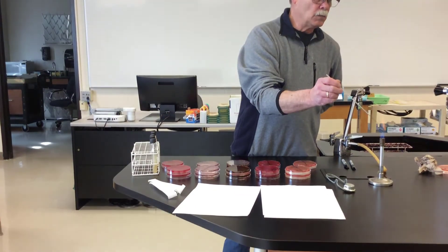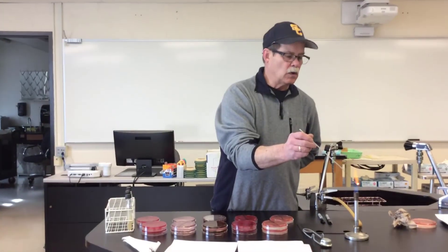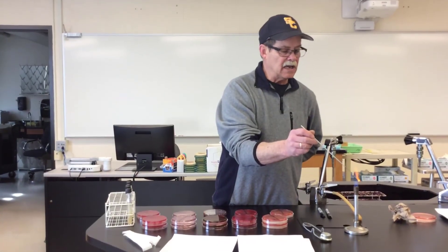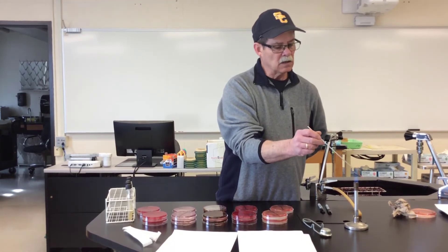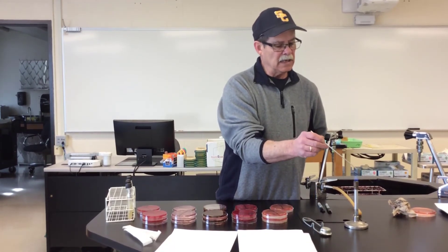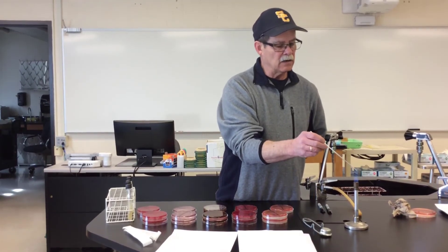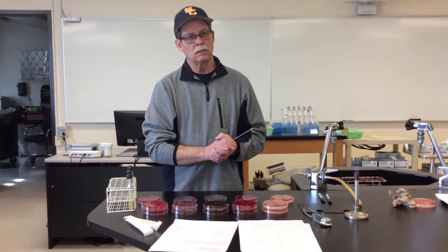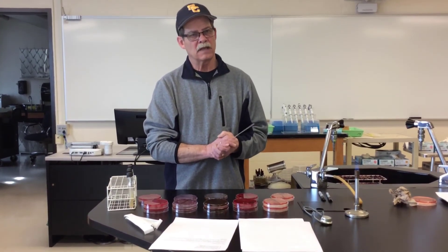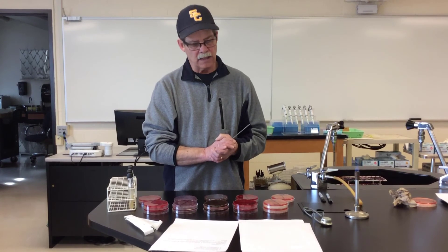Flame our loop, and that's essentially it. I will do the other five organisms on this media, and then all the results will be posted on Canvas by the end of this week. All right, thank you very much. Stay safe.